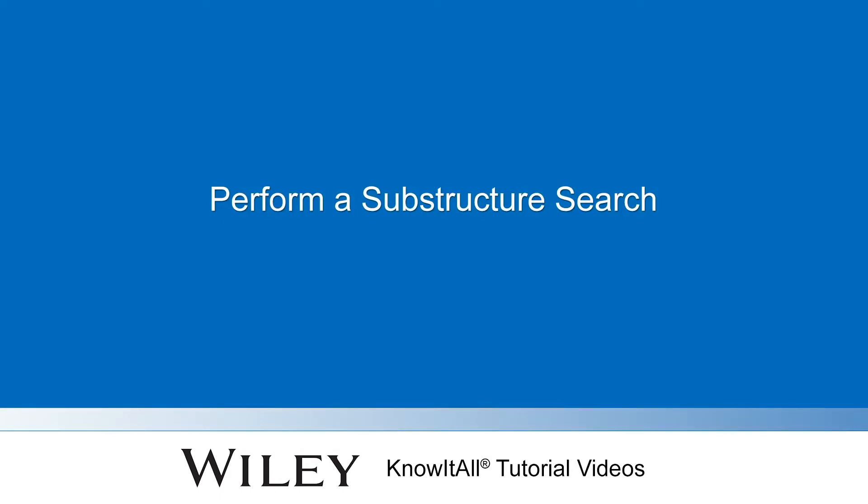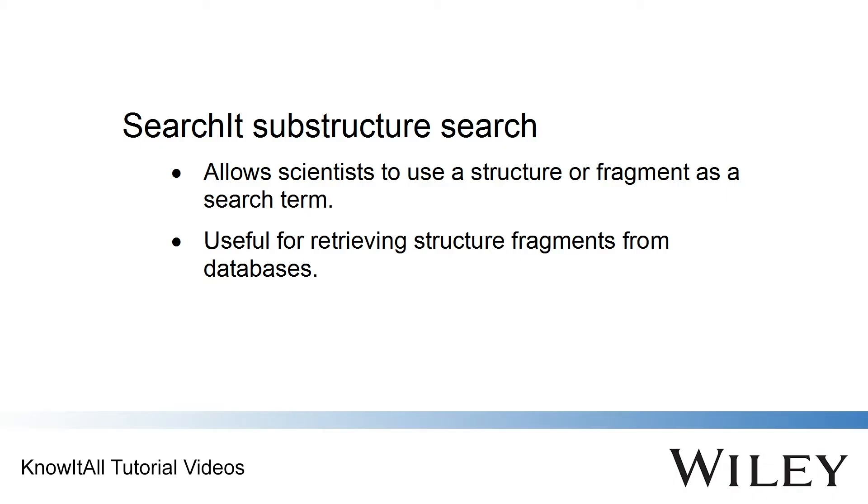Welcome to a demonstration of how to perform a substructure search using the Know-It-All informatics system. In the Search-It application, scientists can use a structure fragment as a search term to locate chemical structures containing that structural skeleton.